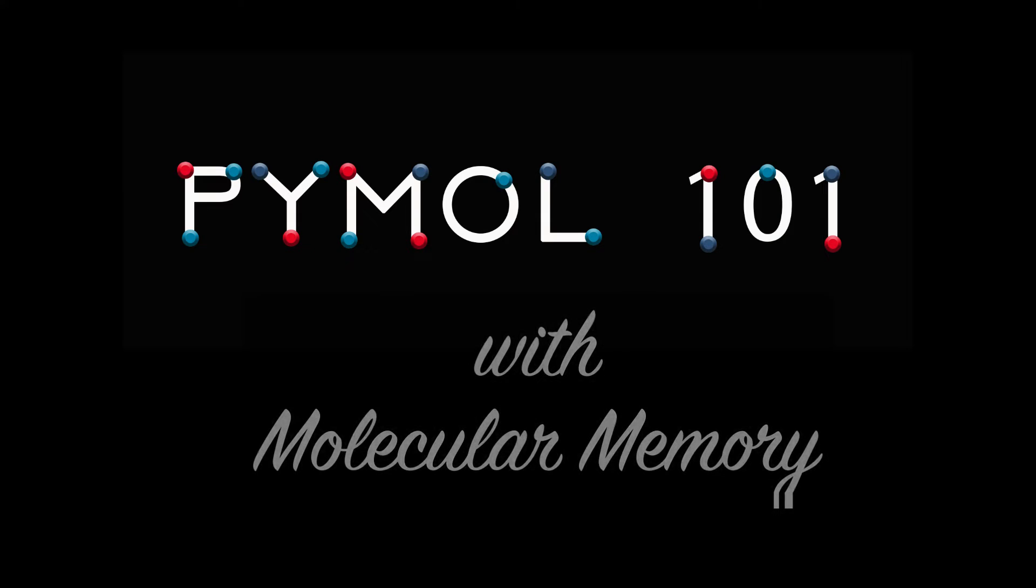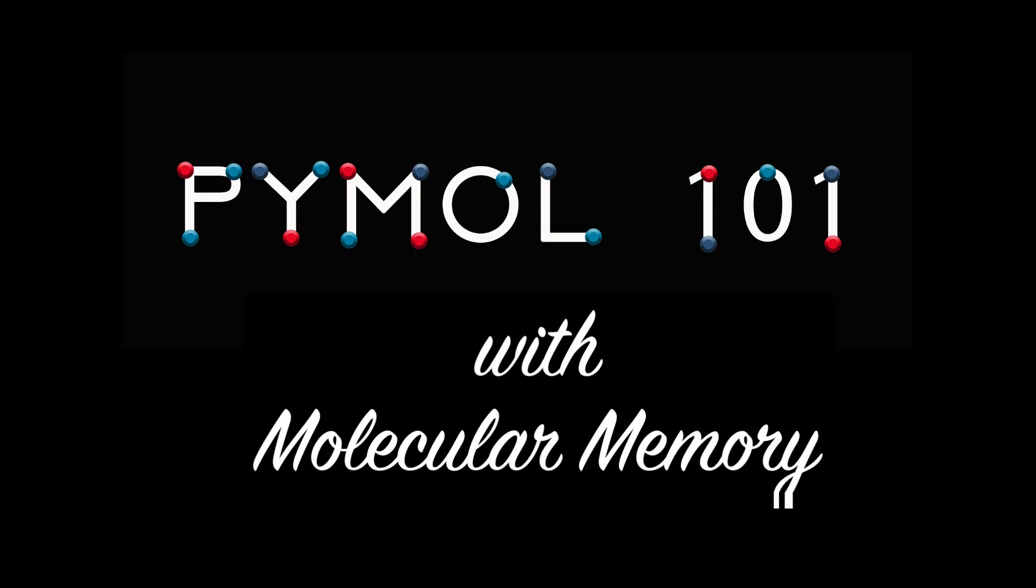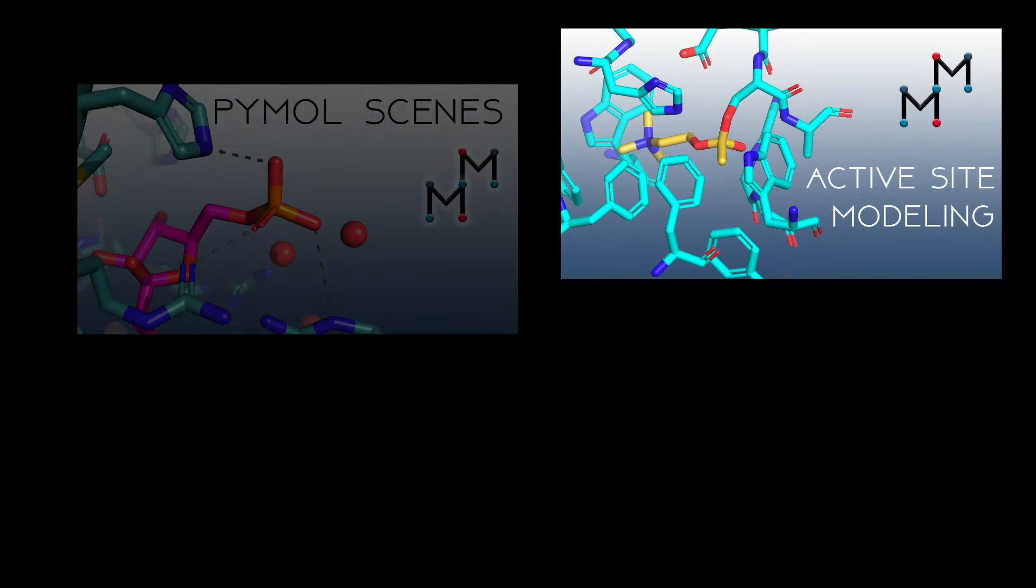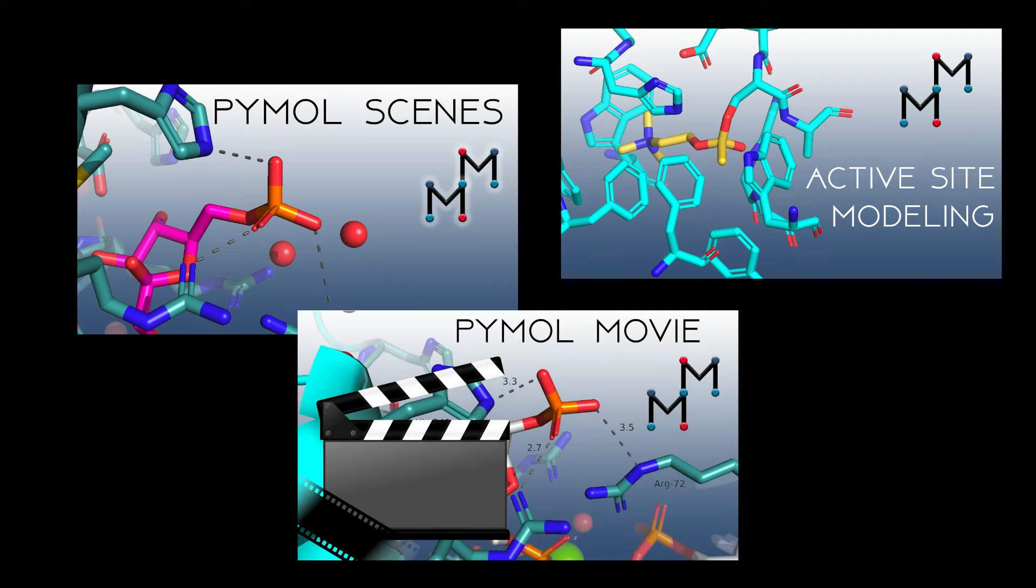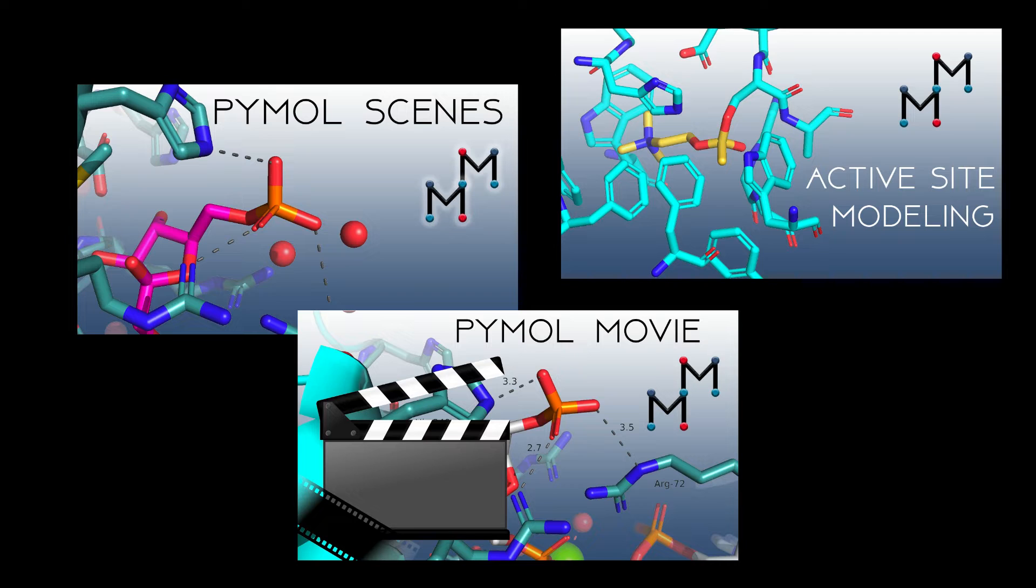Welcome to Pymol 101 with Molecular Memory. KP here. I've done some longer freeform Pymol tutorials in the past, but in this series I'll take you through shorter, targeted lessons, so it'll be easy to get started and find the exact videos you need.